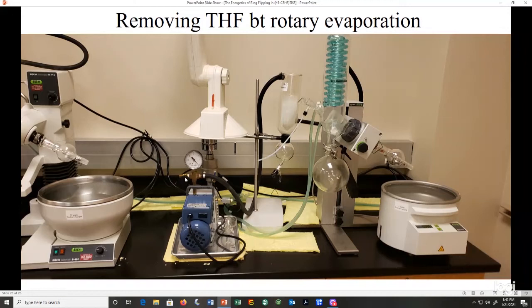And if I had this all the way open, I would be close to atmospheric pressure outside the system. So when we're doing rotary evaporation, we want to find a temperature in our water bath that allows us to hit the boiling point of that solvent somewhere in between atmospheric pressure and real low pressures such as 1 torr.